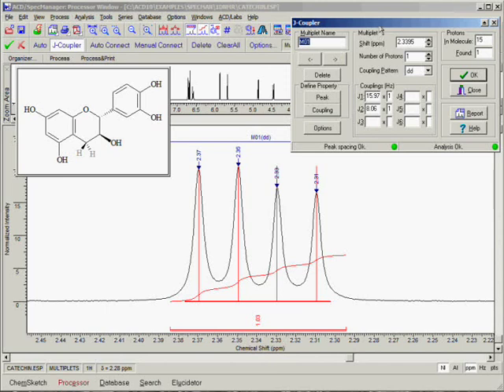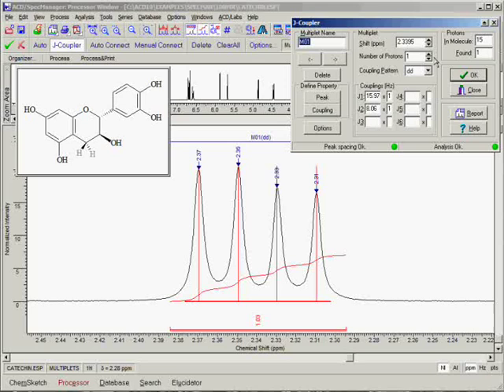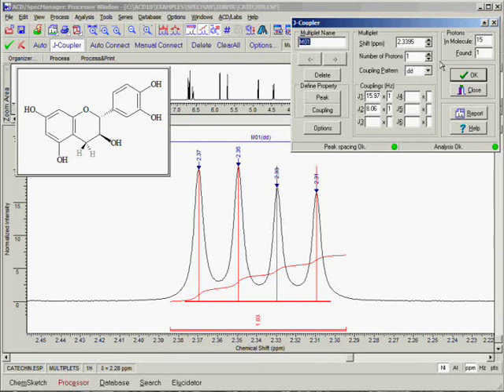The J-Coupler dialog box contains all of the information that you will need to create and edit multiplets in a 1D spectrum. This includes an assigned name — in this case M01, because it is the first multiplet created — the chemical shift in ppm, the number of protons assigned based on the integral area, and the coupling pattern and constants automatically detected. Please note that all of this information is modifiable by the user. The number of protons assigned to the multiplet is normalized by the number of protons on the attached chemical structure. If no structure is available, this normalization is not possible and will need to be set by the user for the first multiplet.